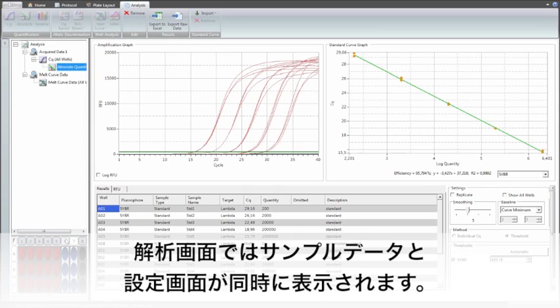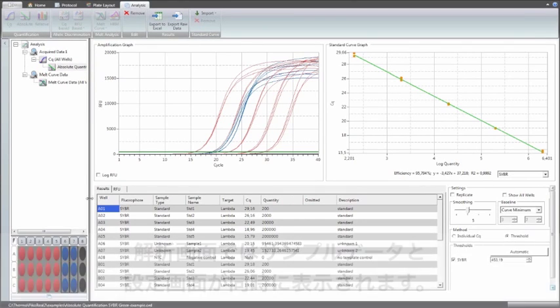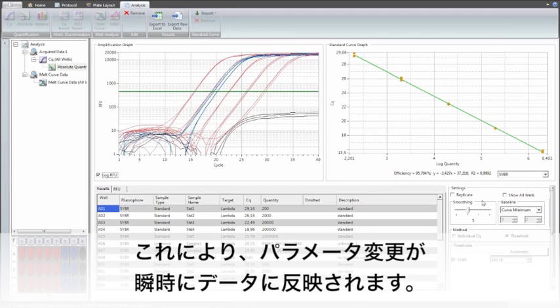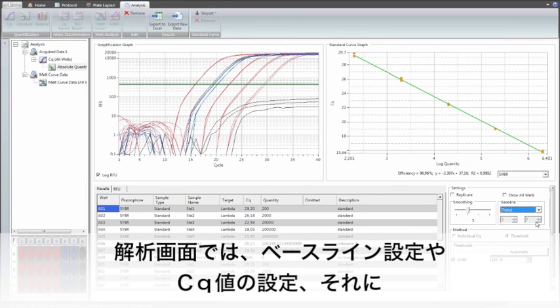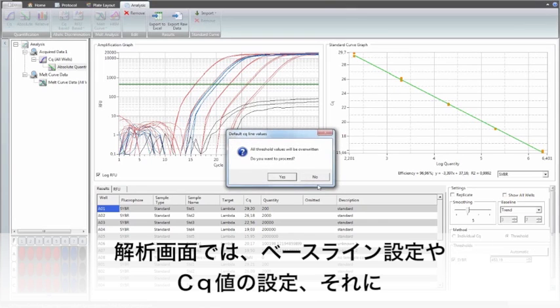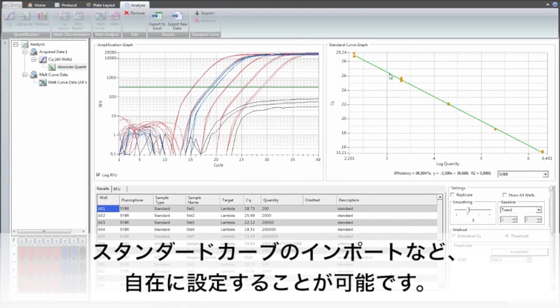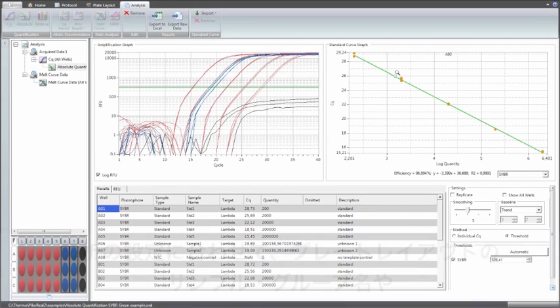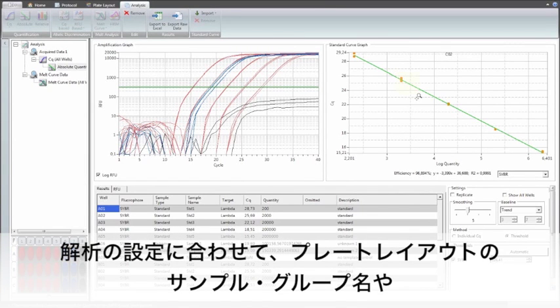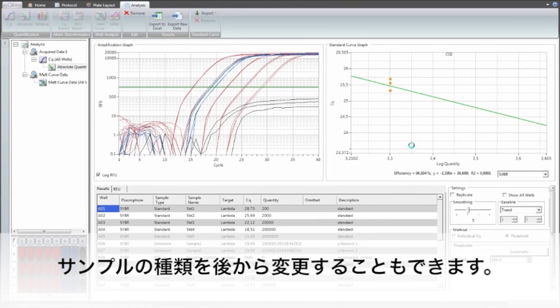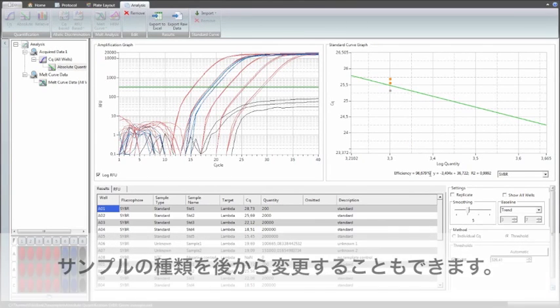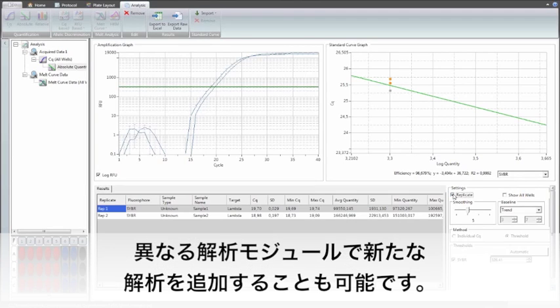The analysis can also be limited to a group of samples to compare different analysis settings on the same plate. In the analysis view, both sample data and settings are placed on the same page, so the effect of parameter changes can be seen instantly. The flexibility in the analysis settings includes, for example, different options for baselining and CQ determination, as well as a standard curve import function. The overall flexibility in the analysis stage allows changes in the plate layout, such as renaming, regrouping, and recharacterizing the samples, and then running new analyses using the different modules.